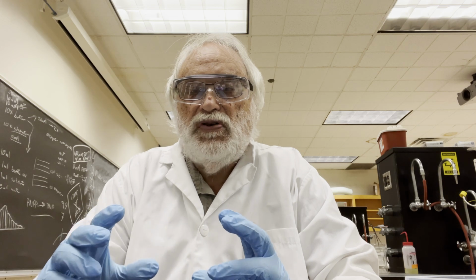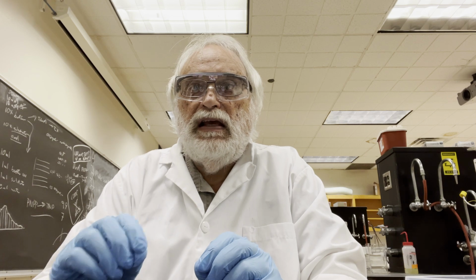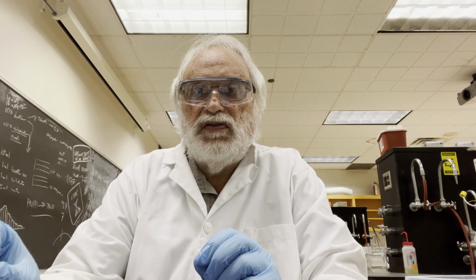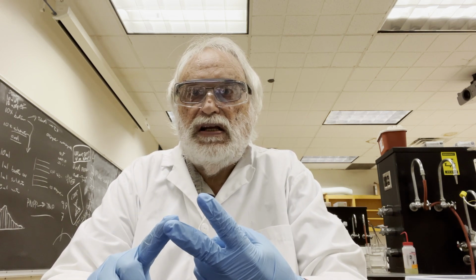We isolated protein from them. We did a chromatography step, and in that step we collected a number of fractions. And then the following week we assayed each of those fractions for enzyme activity and for protein concentration.